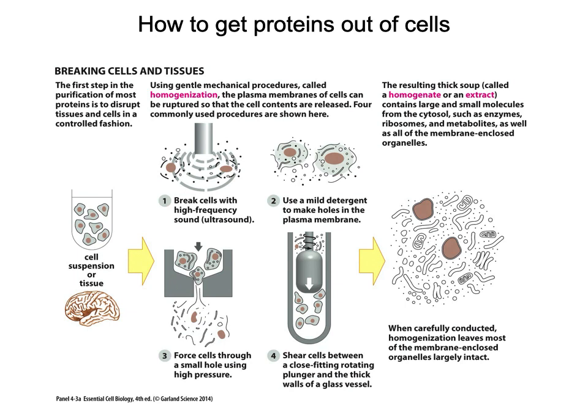So they do make disposable setups where you have this pestle and you put it into a microcentrifuge tube and you can grind it that way to help dissolve it. Usually you would also add a detergent to that, so it's a combination of the second method and the fourth method that allows for the really breaking up of those cells so that you get the homogenate.